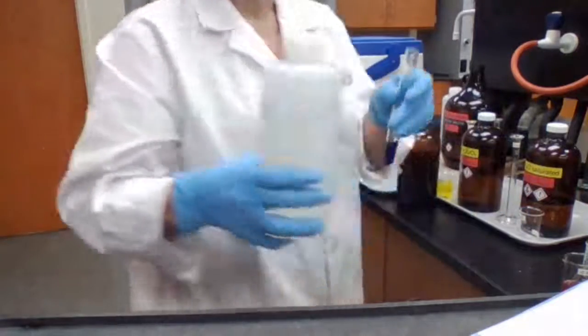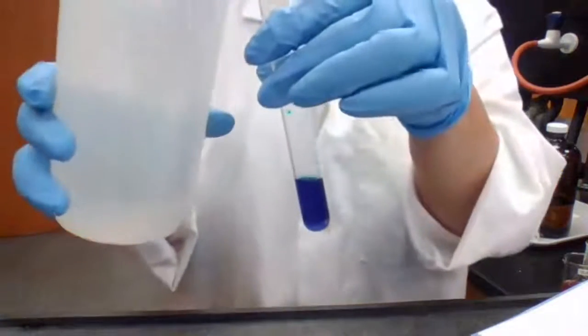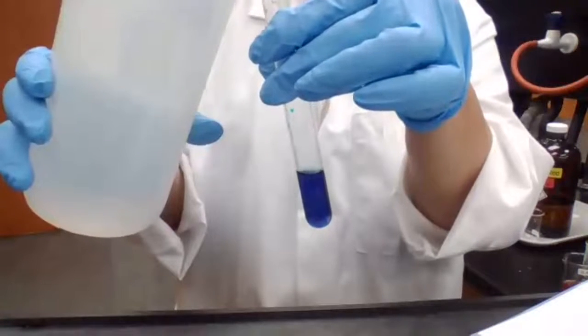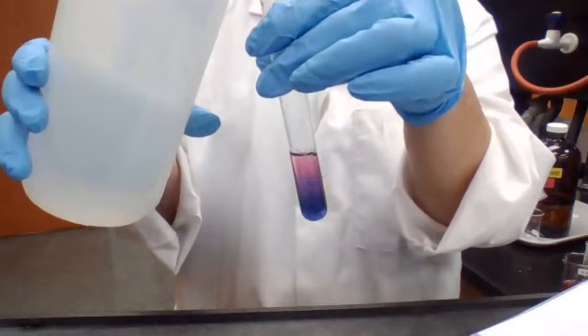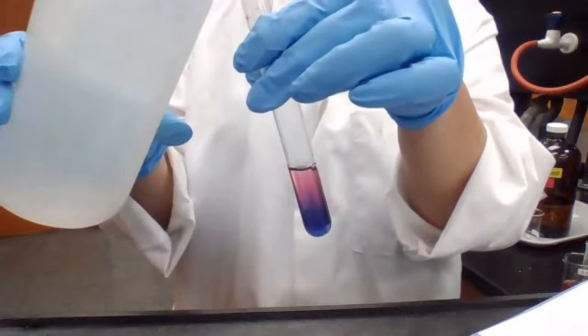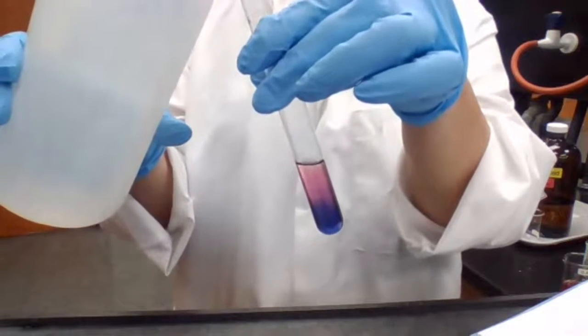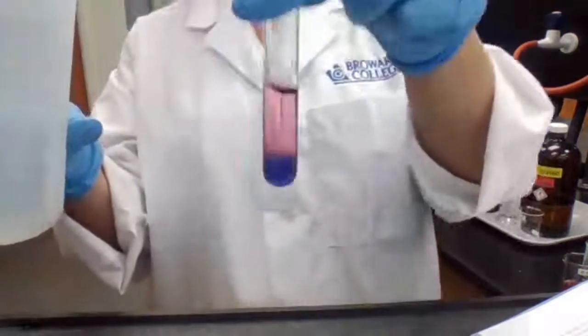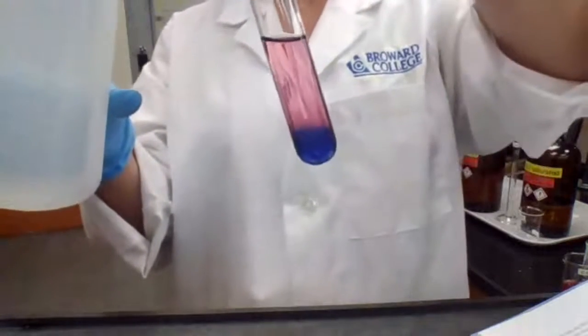If you go back and check the reaction mixture, you can see that adding water is not just going to go from dark color to light color because it's diluted. It's actually changing color.